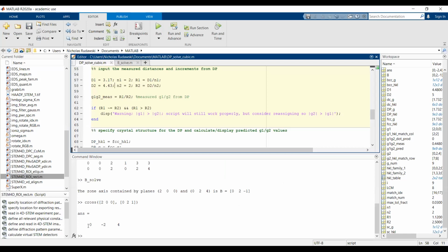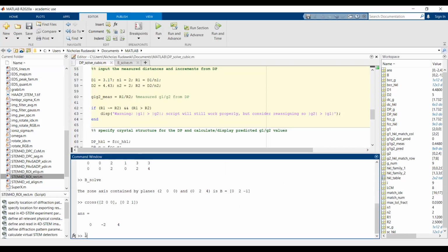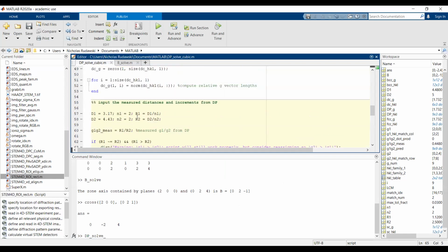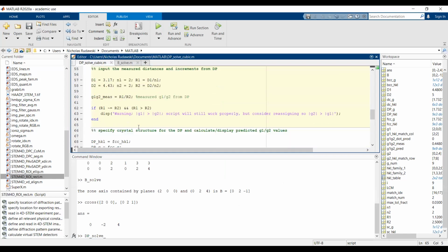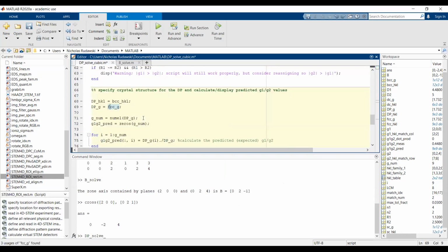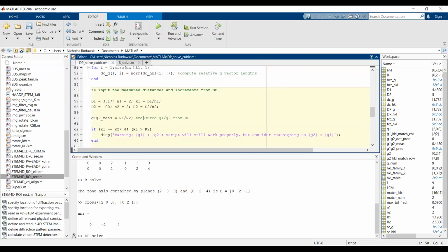Okay, so let's run the solve and see what we get. dp solve. Whoops, and now we have to tell it. Oh, you know what? When I did this last thing, I didn't switch it to body center. Let me switch this here and make sure. It should give us the same answer. Let me go back and change this to the ratio we had.